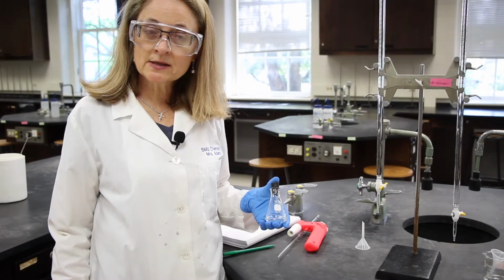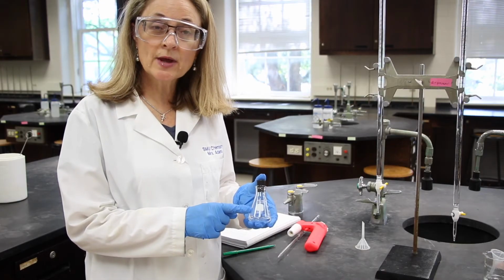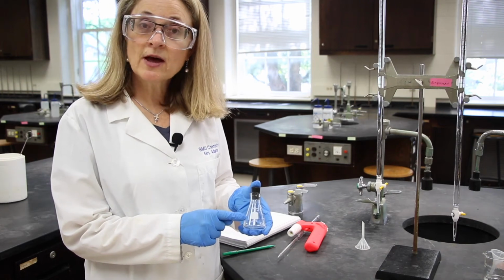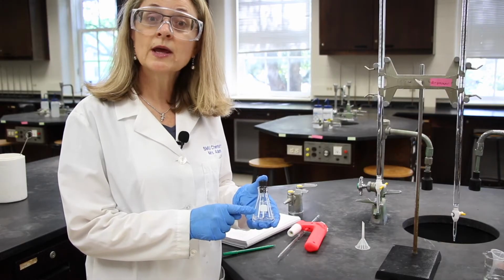In step 6, we need to reweigh our flask, stopper, and the DI water sample that we just delivered to the flask. Please record this value in the mass of the flask, sample, and stopper row in the water column.